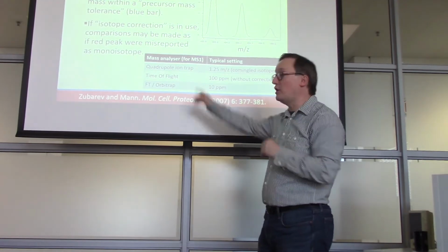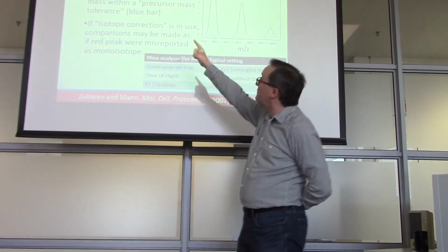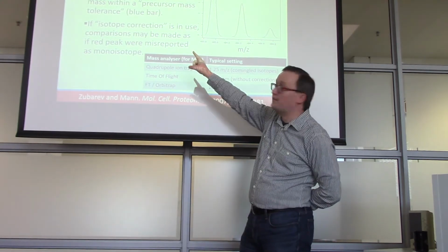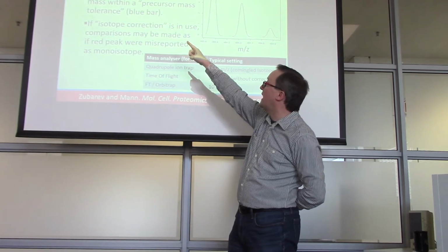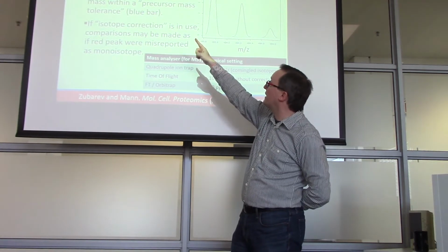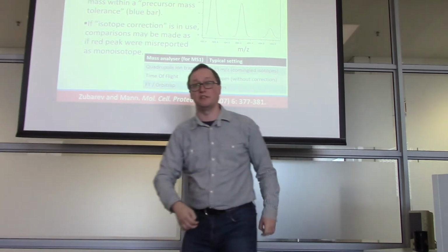All right, so let's start with the peptide mass filter. Peptides can only be compared with the tandem mass spectrum if their computed masses, the weights that we get for these peptides by adding together their residues, agree with the measured mass within some precursor mass tolerance.